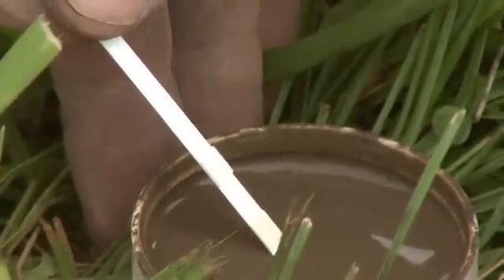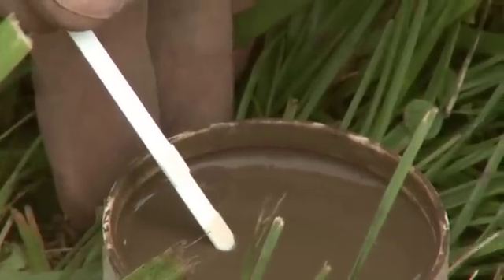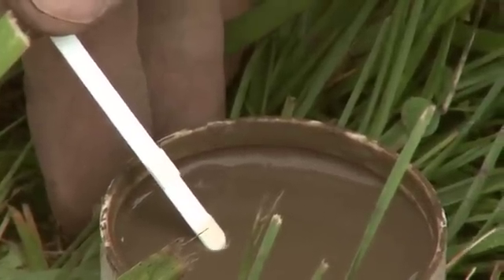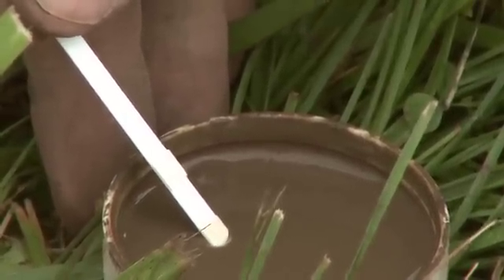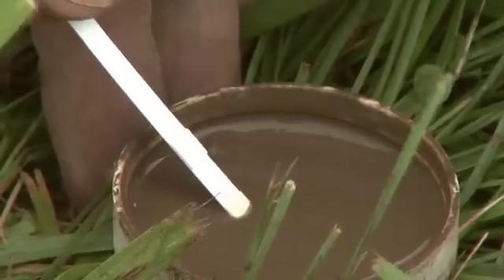We go ahead and break the surface tension — sometimes this is like breaking the surface tension of jello. And then we wait for about a minute to see if we get a change in color.